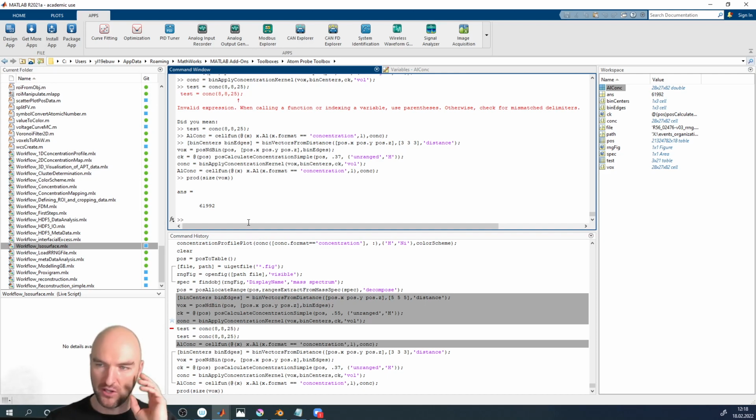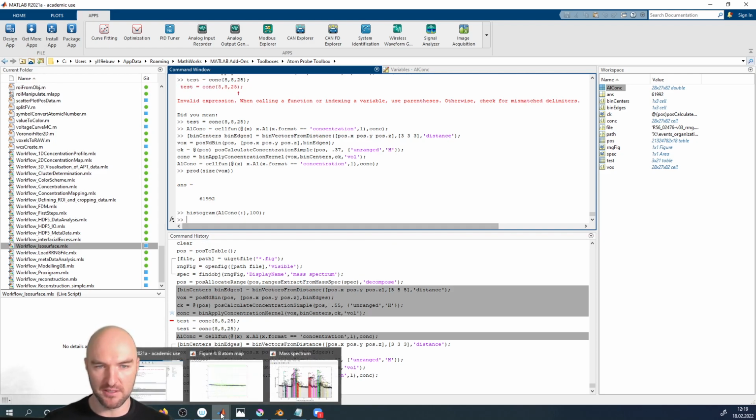We showed you yesterday already the quick way to calculate isosurfaces. We also have the isosurface widget, because that allows you to just drag a slider and set certain things. But one thing that's very helpful is also always to plot a histogram of the concentration. In this case, it's our aluminium concentration. And that should give us an idea of where we could have a reasonable cutoff.